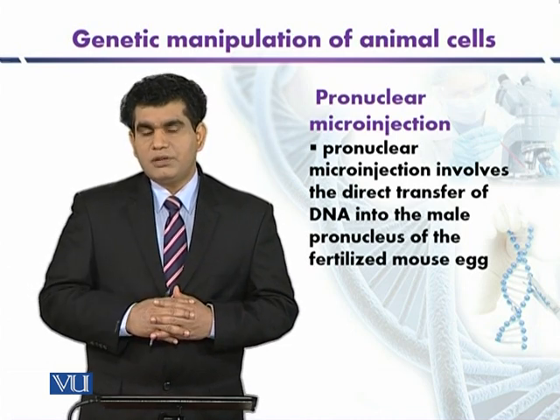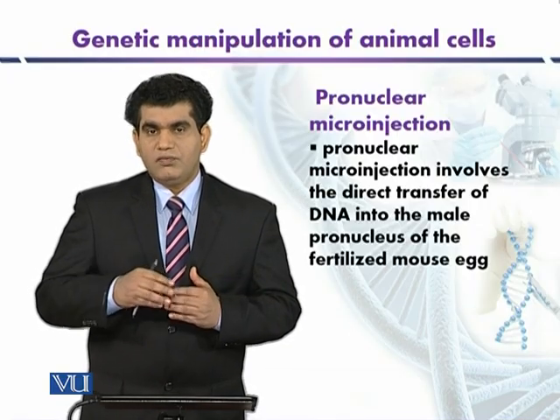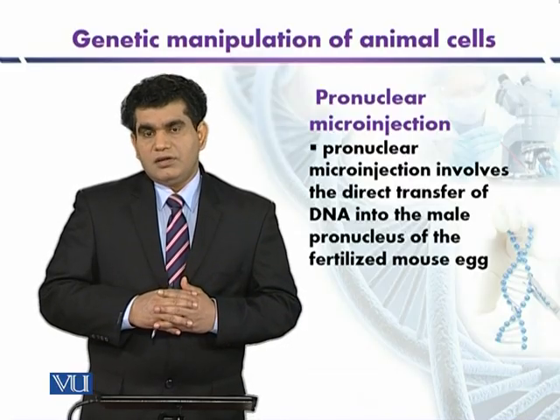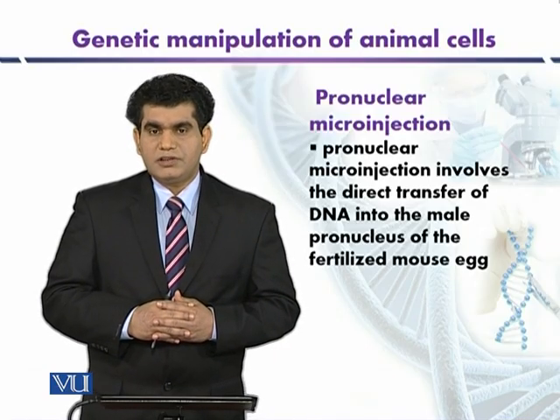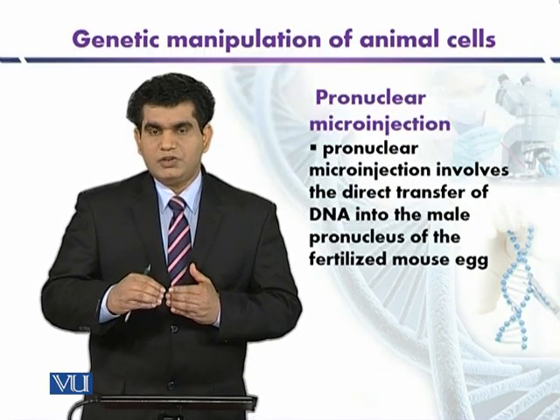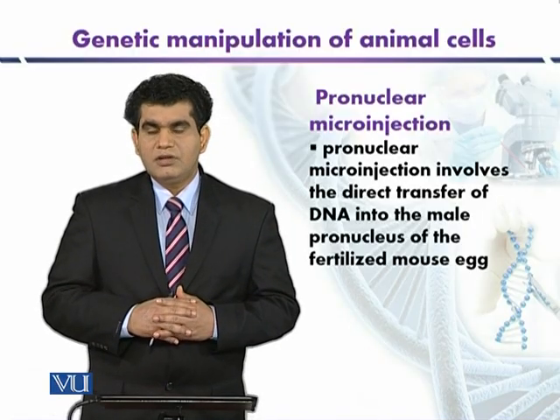It is not only the blastocyst that can be transformed by using the SV40 virus. Rather, egg cells, or fertilized egg cells, can also be transfected by using the microinjection technique. And one of the microinjection techniques that we are going to discuss is the pronucleus microinjection.